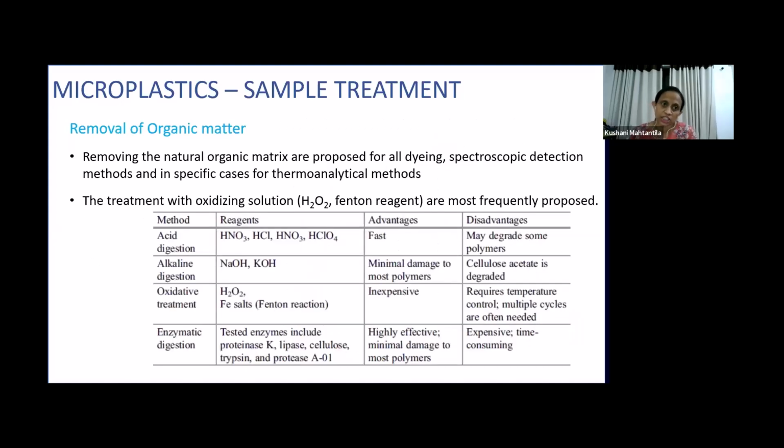So after removing the inorganic fractions, the organic fractions are sometimes extracted with the microplastic because they are also less dense. So removing the natural organic matrix is proposed for all the analytical spectroscopic techniques, and in specific cases for thermal analytical methods like pyrolysis GC-MS. The treatment with oxidation solutions, the Fenton reagent, is most frequently proposed and reported as the best oxidizing solution.